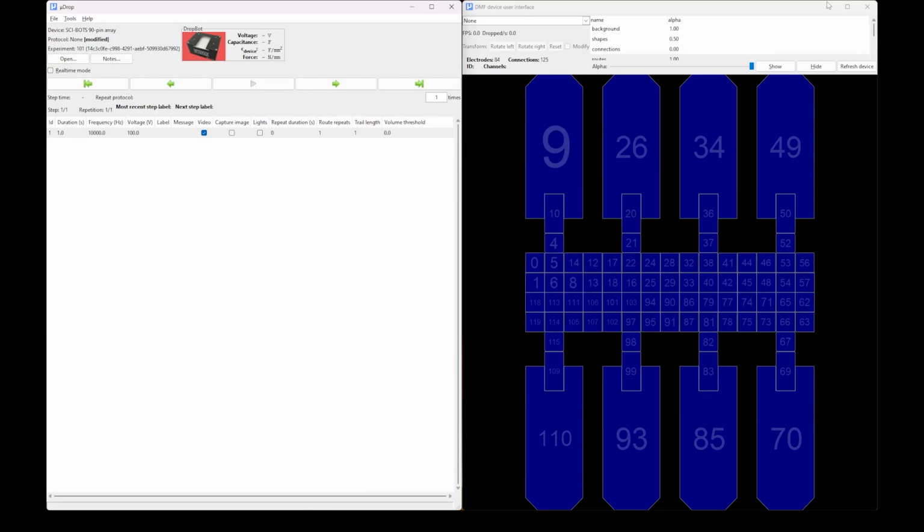First, ensure your DropBot is connected to your computer. On the top right of the main window, you will find the DropBot monitor. Note that the color of the icon represents the DropBot's connection status. Red means the DropBot is either not connected to the host computer or not powered with a 12-volt supply. Also, if you hover over the icon with your mouse, it will display a message of the DropBot's current state.